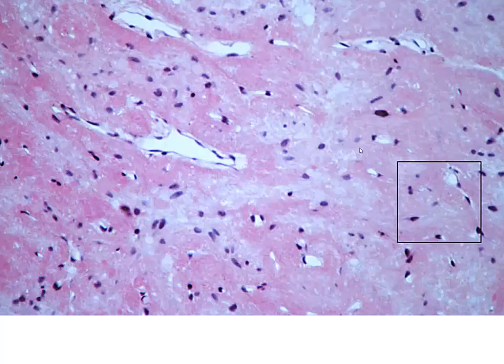The neurohypophysis, this is going to be very neuronal looking. The cells we see, we collectively call them pituocytes. And as we look at higher magnification a little bit later in our slide presentation, remember that the mottled look that we're going to see, especially if we look in this area, we can see some fairly large ones. These are called herring bodies. These are accumulations of the hormones in the cytoplasm of these pituocytes. We're also going to have capillaries, lymphatics in through this tissue.